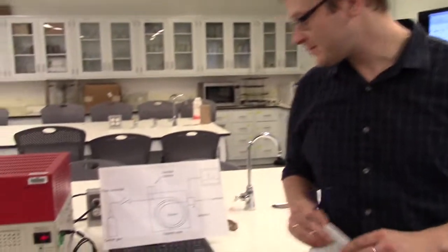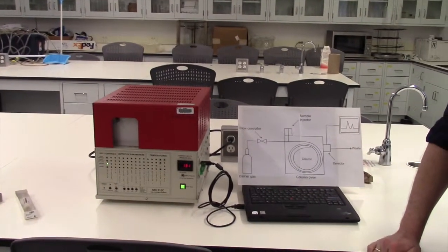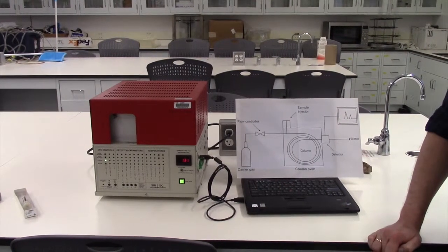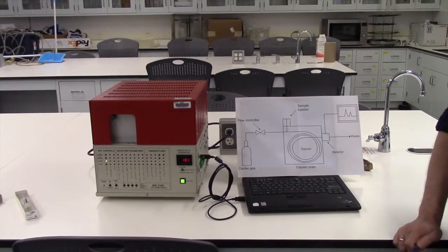We have a gas chromatograph in front of us, and the main principle of any gas chromatograph consists of the following.